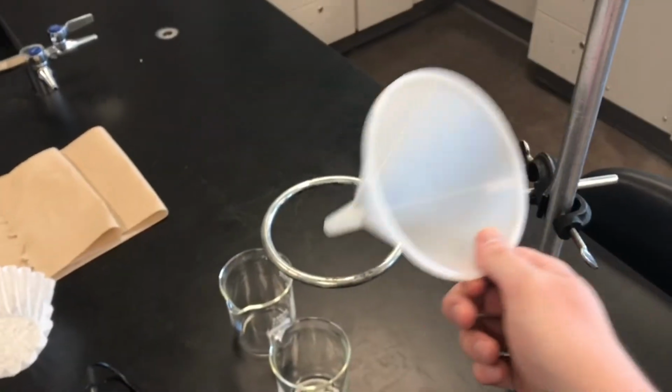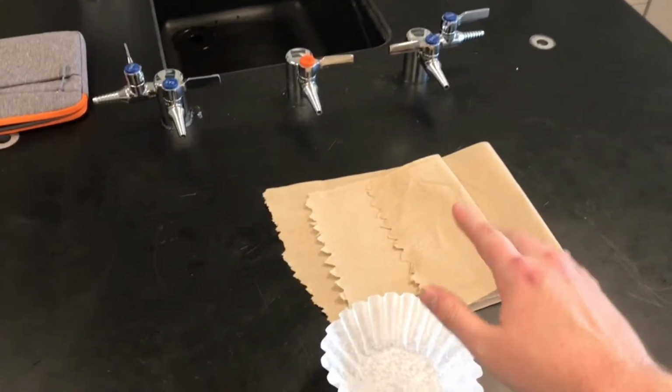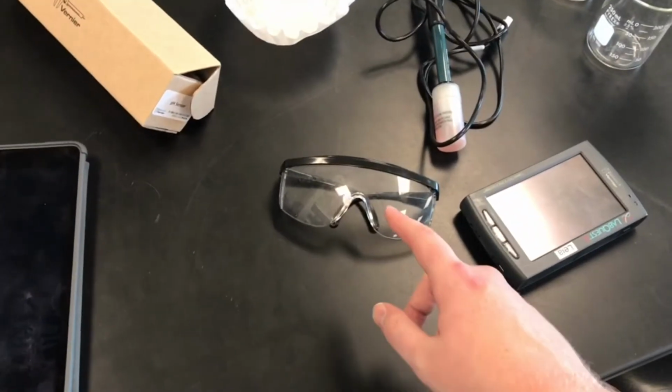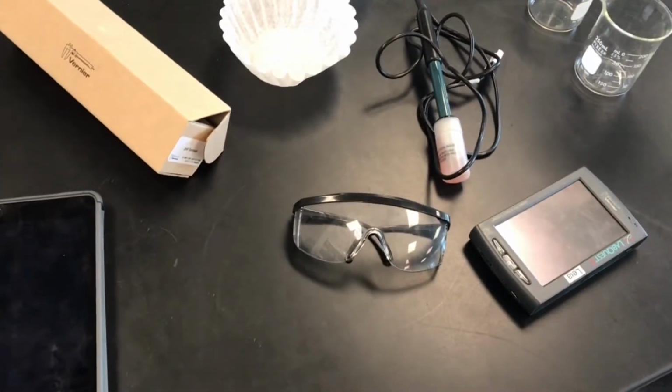So ring stand pole, I'll just put the funnel in right now. 2 coffee filters. You're gonna need probably some paper towels. Lab gets a little messy. Or if we have towels in the room, grab a towel. And goggles. So everyone's gonna need to wear goggles for this lab.